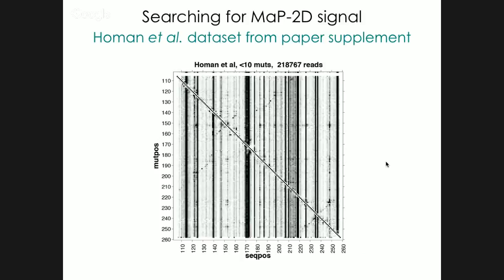But now that we saw that we can find two-dimensional data within these high-dose mutational profiling experiments, we wanted to recapitulate the P4P6 dataset by performing our own experiments. This ended up being a pretty long process because we were trying to track down the actual source of the correlated mutations.